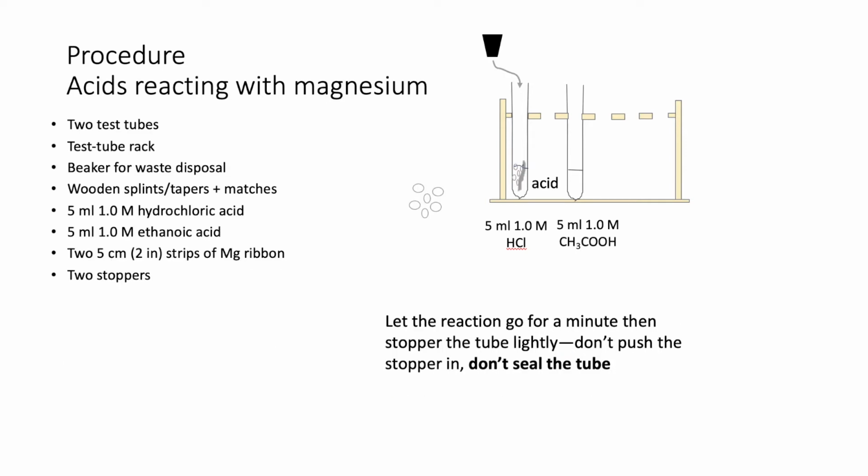And you're going to drop in about a 5 centimeter strip, a 2-inch strip, firstly into the dilute hydrochloric acid.